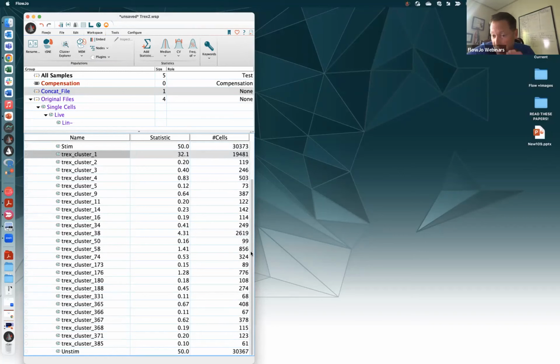Reading the question in the chat, my Spanish is meh. I'm going to say the question is, can I use more than 2 categories for T-Rex? And the answer is no. It is just specifically set up to do a 2-category comparison, so we don't have to deal with multiple comparisons tests. Sorry. Feature request for the future.